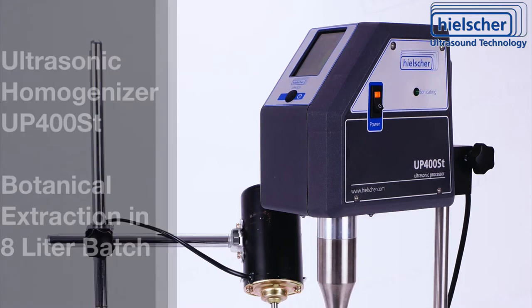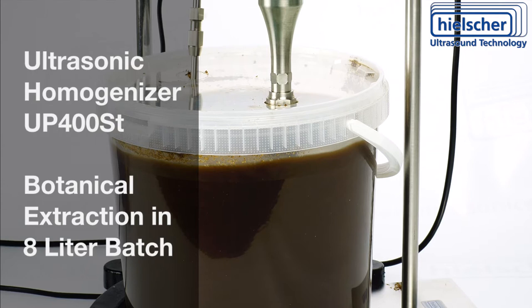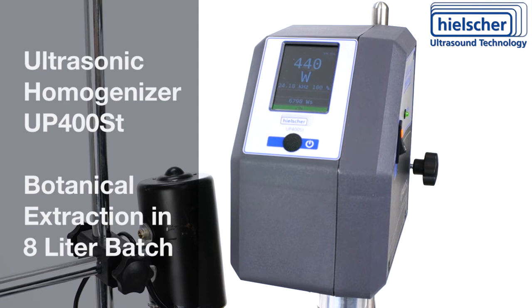The Hielscher UP400ST is a very powerful ultrasonic homogenizer for many applications. You can sonicate samples in beakers. However, the 400-watt homogenizer is powerful enough to process larger batches too. In this video, the Hielscher UP400ST sonicates an 8-liter batch for botanical extraction.